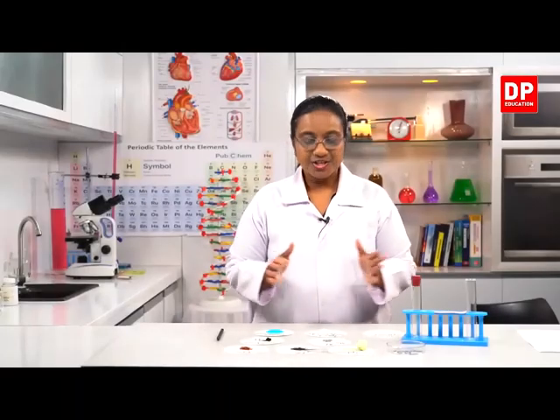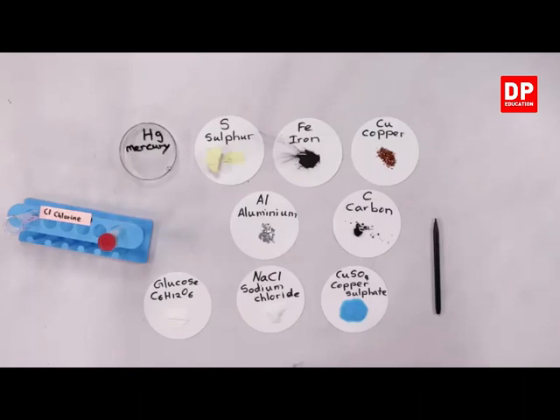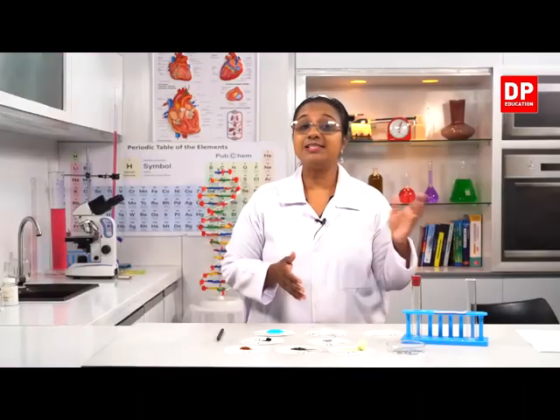Okay, students. So now we are going to observe the different types of pure substances. You all know how to classify pure substances and non-pure substances. What I have here are all pure substances. So again, how do we classify pure substances? As elements and compounds. As examples for elements and compounds, I have all these substances.